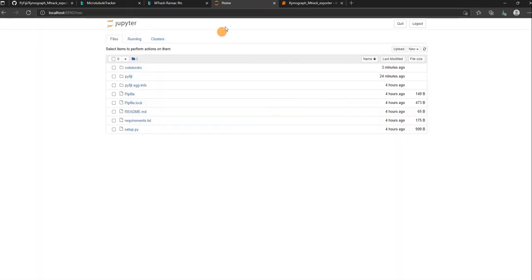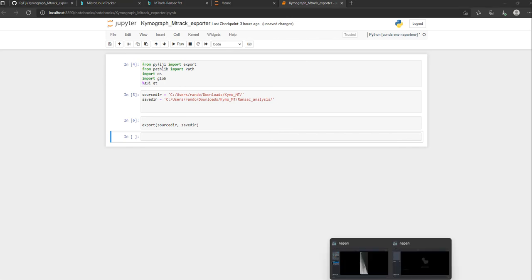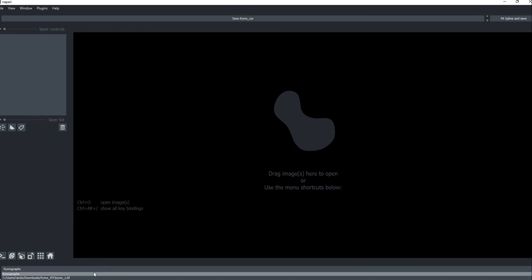So what I did was make this new Python based tool called pyfiji. And what pyfiji has is the precursor tools which would be needed if you want to go into Fiji for some of these tools. For example, in this tool, what you are doing is loading your directory of kymograph images, and then you are using the shapes layer of Napari to make a path. So this shapes layer automatically pops up when you select one kymograph from the directory, and then you select the add path functionality of Napari, and then you draw this shape over your kymograph.